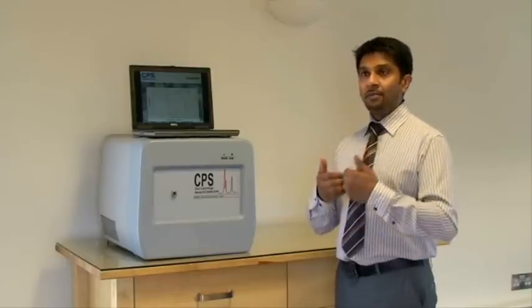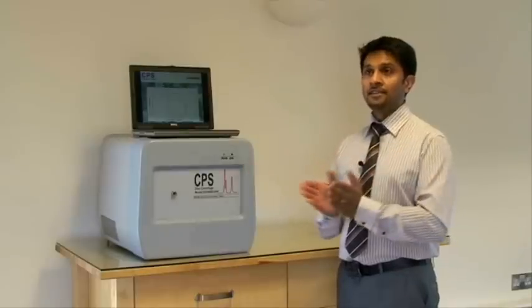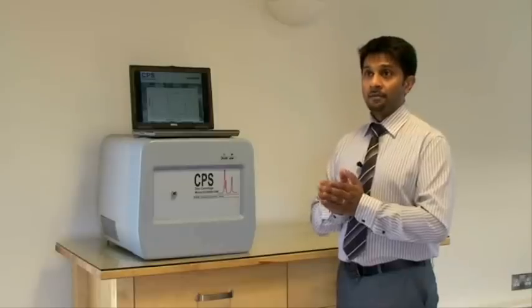The reason for this is because before we run a sample, we always calibrate the instrument, meaning we run a sample of known size and known density, and we are able to use this to convert the time axis to particle size for the material that you're examining.